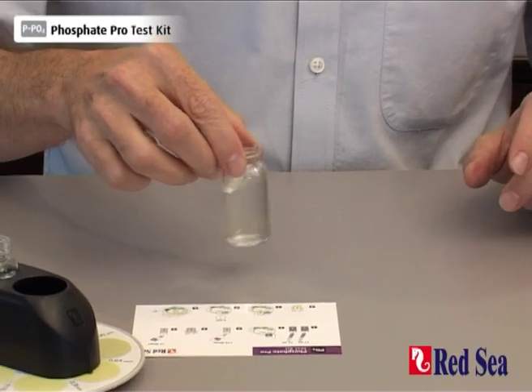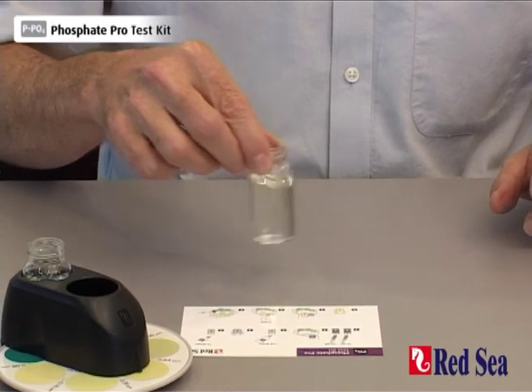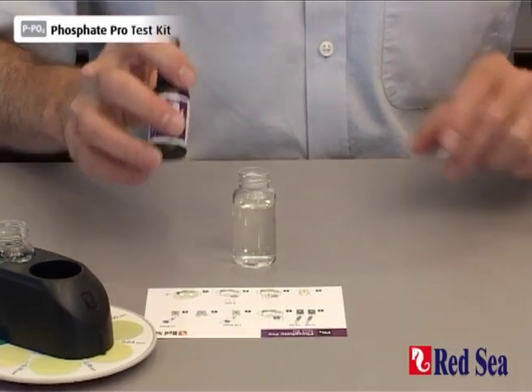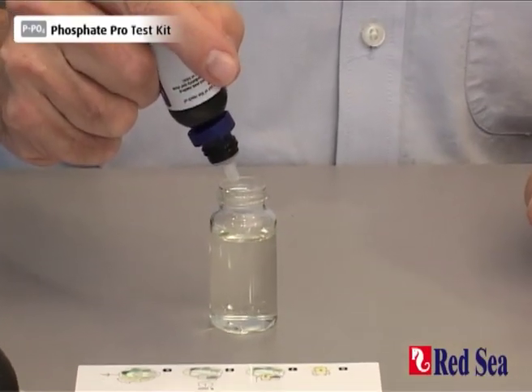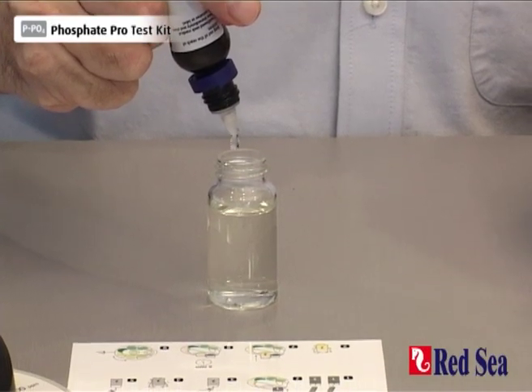Gently shake the vial to ensure that the reagent mixes with the water sample. And we're now going to add two drops of reagent B. One, two.